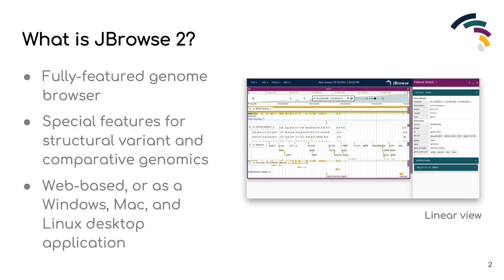JBrowse2 is a genome browser with novel features for visualizing structural variants, syntenic alignments, and multiple types of genomic data. JBrowse2 supports a variety of common data types and has the capacity to be extended to support any data type that a user might require. JBrowse2 has been designed with a plugin framework that allows developers to extend existing JBrowse components and implement completely custom new ones.